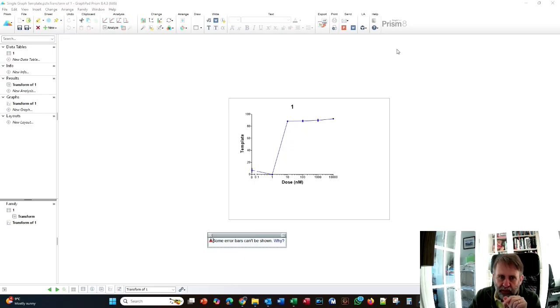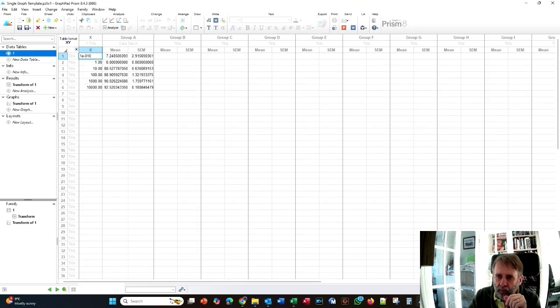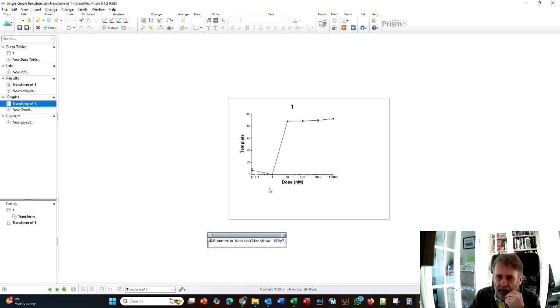this particular experiment. You can see that the way it works is it's a logarithmic scale. So the doses are 1, 10, 100, 1,000, 10,000. And then the 0 has been cheekily recoded to 1 times 10 to the minus 10. And I've used the Prism graph multiple axes to create an axis break. Obviously the reason for doing this is you want it on a log scale to get the dose response. But what you can't do is put 0 on the log scale because 0 is undefined. So all I've done is put an axis break so I can create an artificial 0.